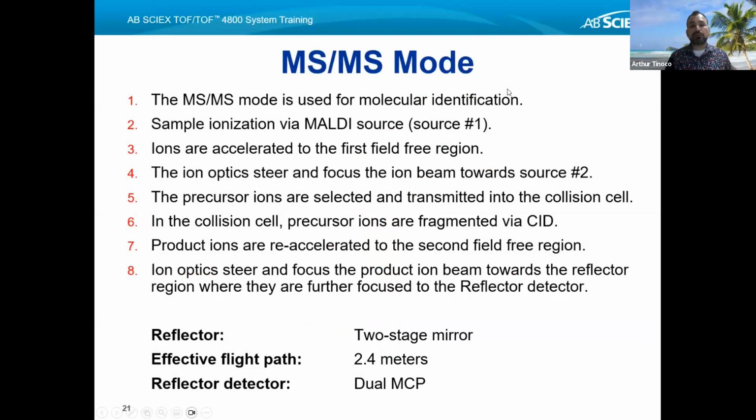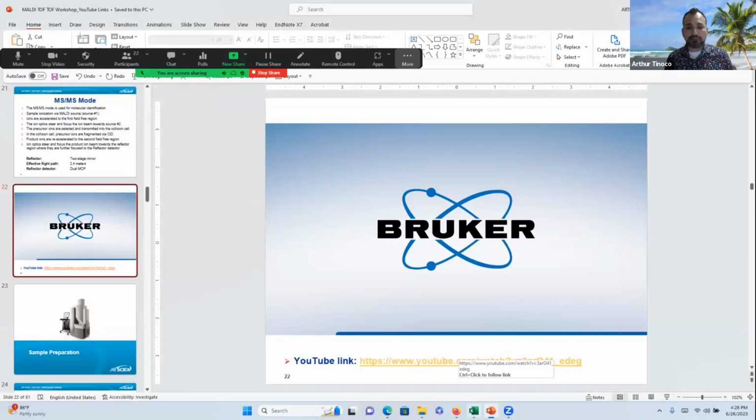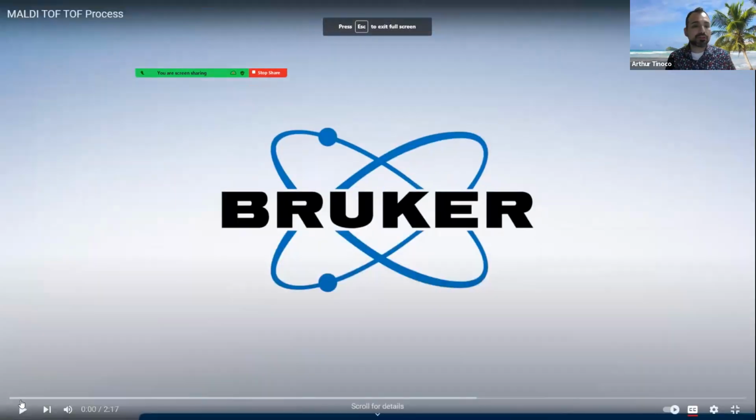Essentially, you're going to direct your parent ions into the source, into the mass analyzer, fragment those ions, create daughter ions, and then all of those are going to get directed to the reflector detector at the end. All right, so here I have another video that's going to give you a better perspective of this. So let me go ahead and project this video.